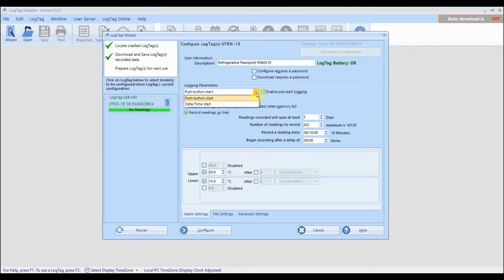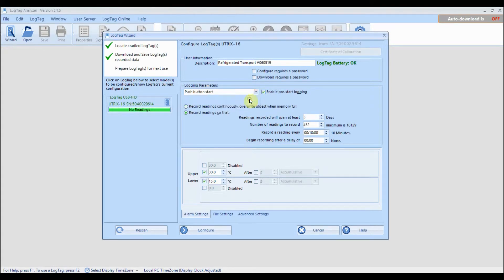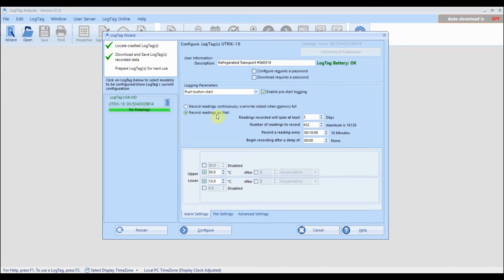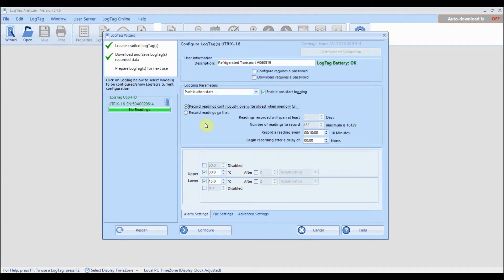Select if you wish the logger to start recording at a specific time and date or when you push the start button. Next select whether you want the logger to stop recording once the memory is full or to overwrite the oldest reading so logging never stops. This is called continuous recording.